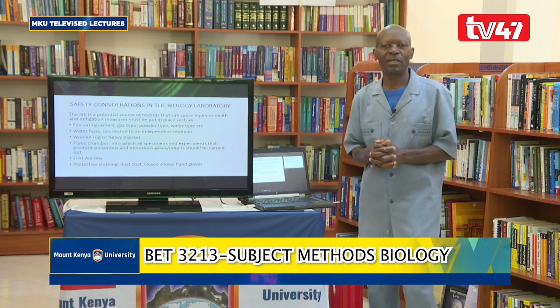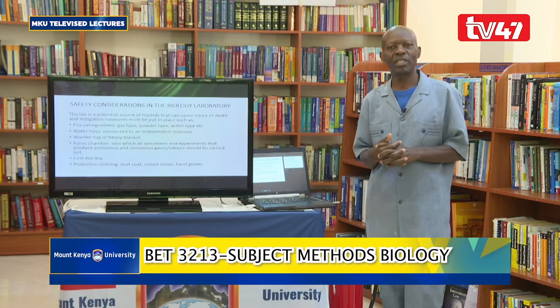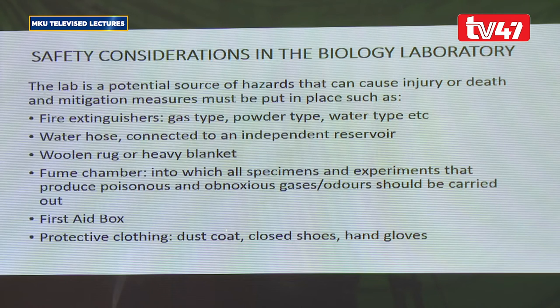The next small subtopic under the biology laboratory is safety considerations in the lab. Much as we appreciate the contribution the biology lab makes to teaching and learning, it also has its demerits. It can be a source of injuries, it can be a source of discomfort, and therefore there are some safety considerations that you should have in mind whenever we are working in the lab. It is a potential source of hazards that can cause injury or death. So mitigation measures must be put in place.